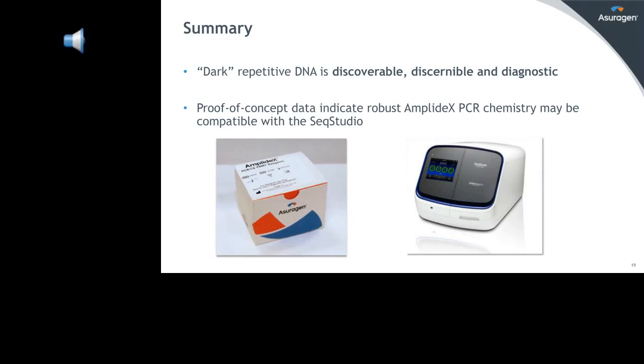We can certainly use less, and in fact, part of our evaluation was to do a titration series. We were able to go down to much lower quantities, in the range of even 1 nanogram or so, but our standard conditions are in the 40 nanogram range, and that's also to accommodate the ability to look at some of the lower level signals that may be present, so you can get a fully informed view of the information from the sample to support the clinical research questions you may be interested in.